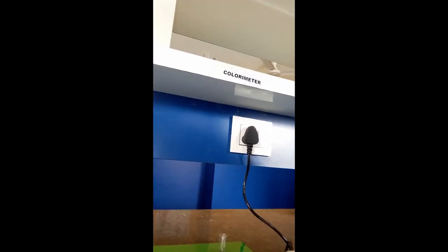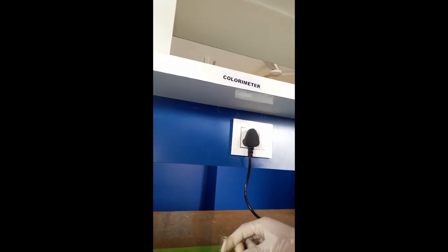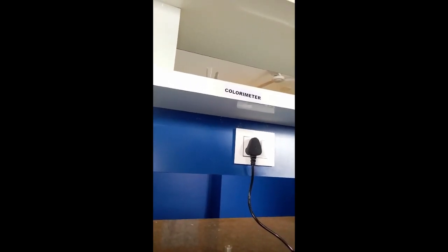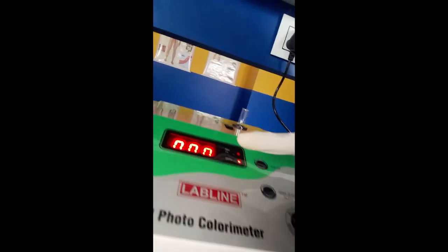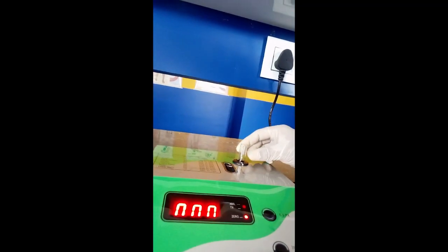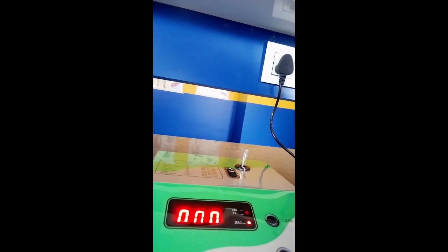Okay, so before you put your solution, you have to adjust the 0. Before you put your solution tube, you have to press it, and you have to ensure that there is a 0, and then you put your reagent and take the readings, note them down.